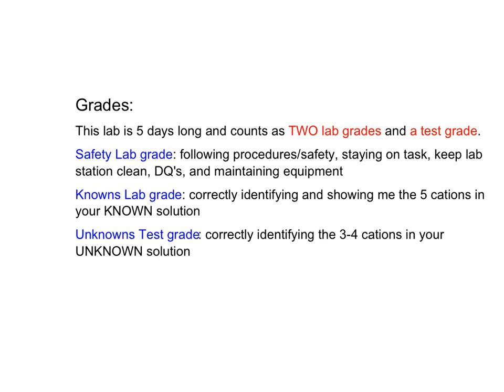So you would bring the test tube with the yellow solid in it and say, Mr. Flato, or Miss Donaldson, or Miss Thomas, the presence of a yellow solid indicates the presence of lead plus 2 ions. That's exactly what you're going to do. And you're going to do that for lead, you'll do that for silver, iron, nickel, and copper. Each one of those cations is worth 20 points. So 5 ions times 20 points should be a nice, easy 100 lab grade for that.